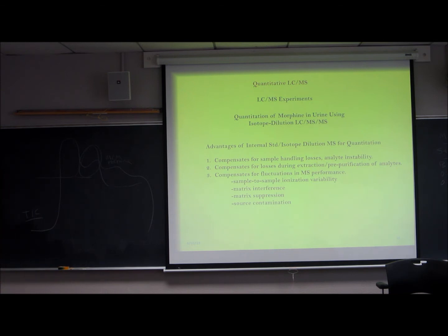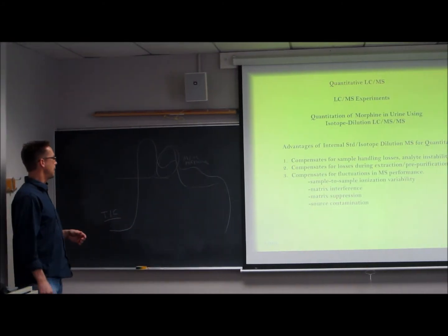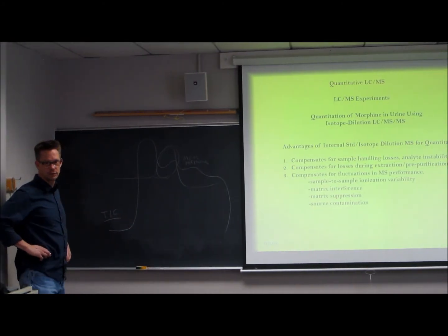And the other thing that I mentioned before was, very often you'll be looking for compounds for which there's a diastereomer, for which there are structural isomers, in which case chromatography is actually absolutely essential because you have to separate them chromatographically because their mass spectral behavior is the same.